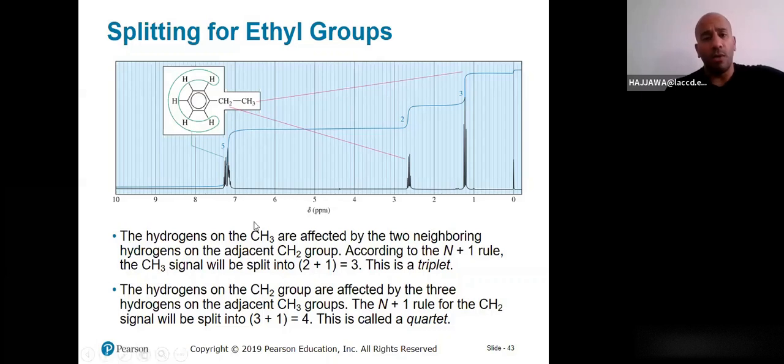Okay. Now, am I responsible to figure out within the 7 ppm where these hydrogens are? Well, in that case, no. When it's a mono-substituted benzene or di-substituted structure other than para-substitution, meaning you have a substituent on this side and another substituent on the other side that's opposite to it, you're not going to see that in this course.